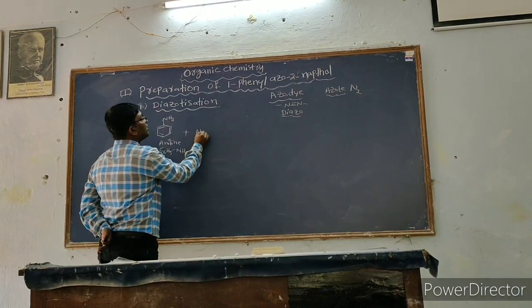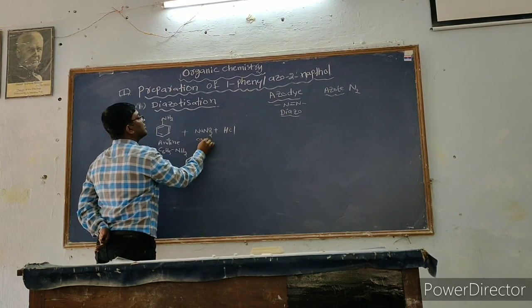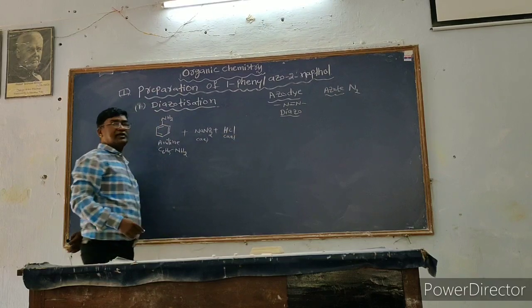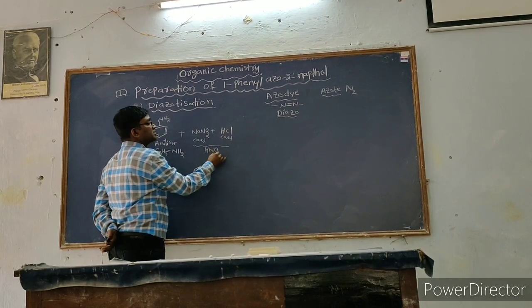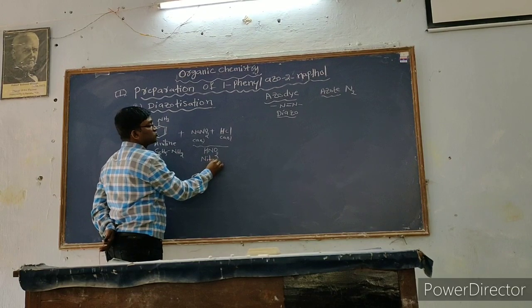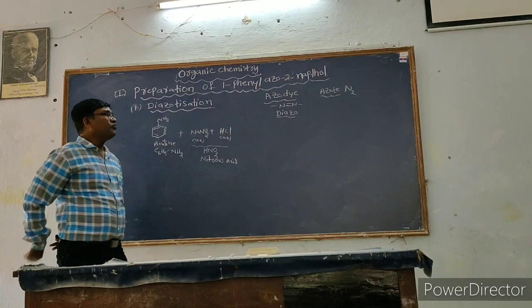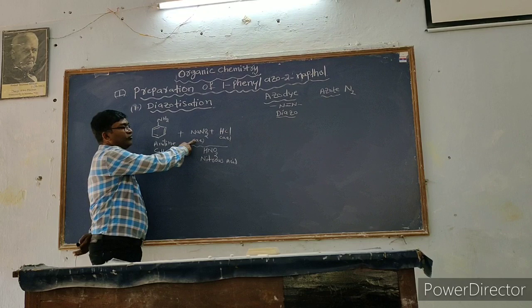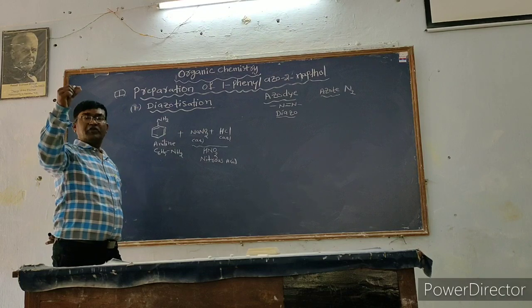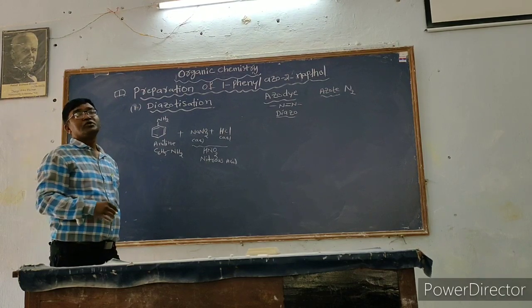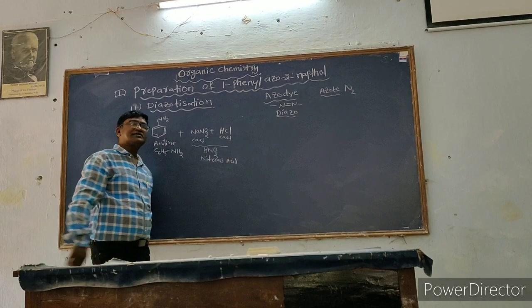Nitrous acid is prepared by mixing sodium nitrite with HCl solution. Nitrous acid is unstable, so we prepare it in the lab whenever we require it. We have to take the HCl solution in another test tube and cool them, maintaining very low temperatures.